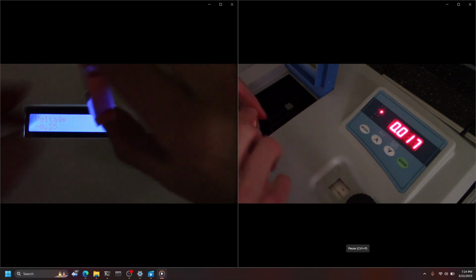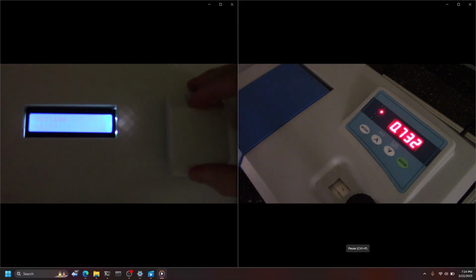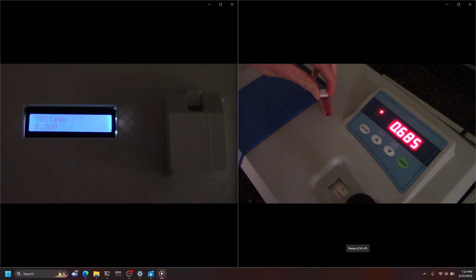So as you can see on both sides, you have the 50% volume of the sodium hypochlorite with another 50% volume of the red dye, in which we shake it up a little bit and we put it into our spectrometers. On this right hand side, I just did a third batch reactor just to show you a visual representation of what is going on inside the cuvette, inside these spectrometers.